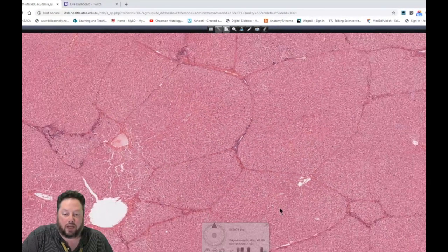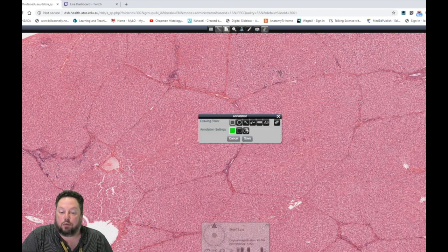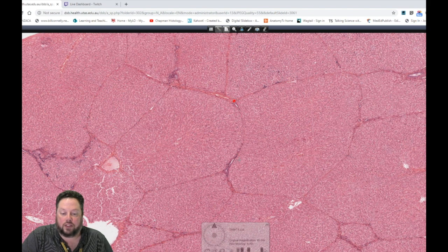The third way to think about the liver structure is the most clinically relevant. Previously, when we talked about blood flow, we talked about it arising from these points and then flowing into these central veins here. But in fact, what we saw when we zoomed in here, we did see blood vessels within all of this stroma.